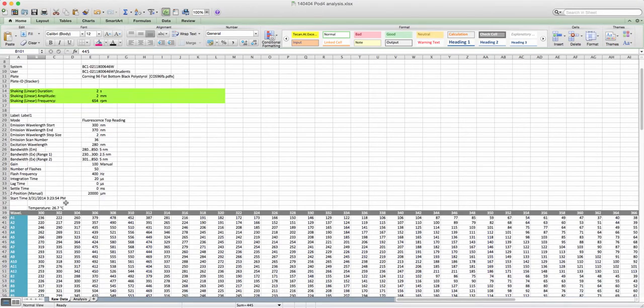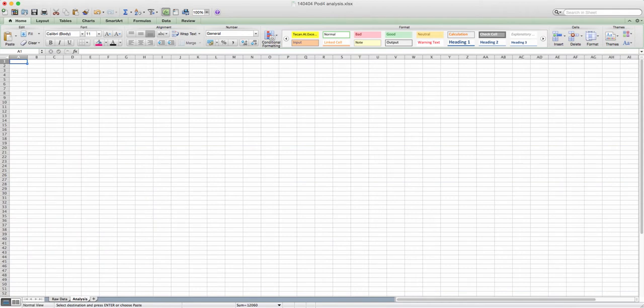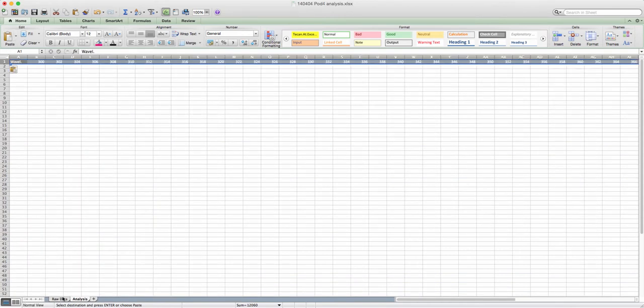We collected blanks at every urea concentration that was tested, and I'm going to go through and just write out the urea concentrations quickly here, again, just to help me keep track of what I'm doing. So these are the actual concentrations that this group tested of urea. So yours, of course, may be different than this. Okay. And then I'm going to copy the wavelengths over into the analysis spreadsheet, so I have those.